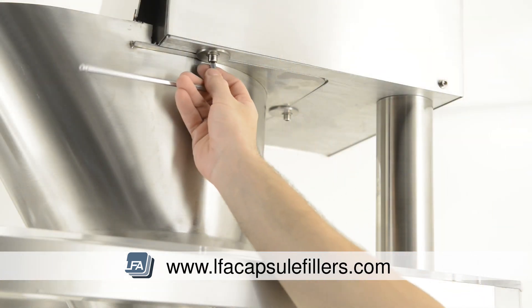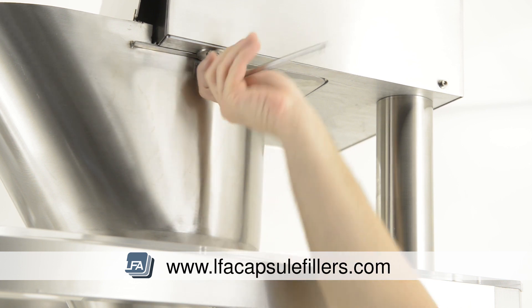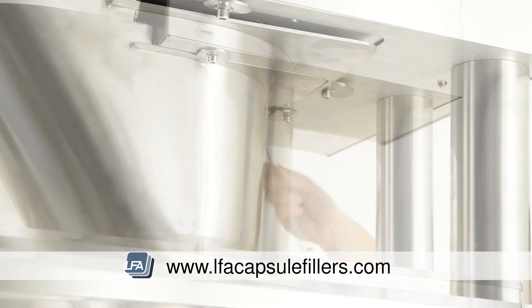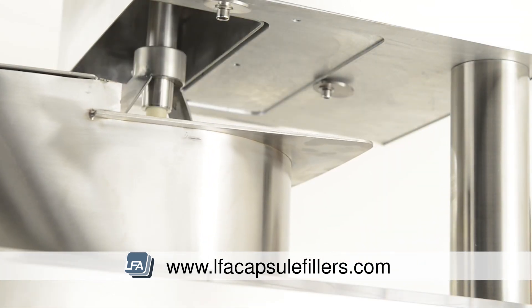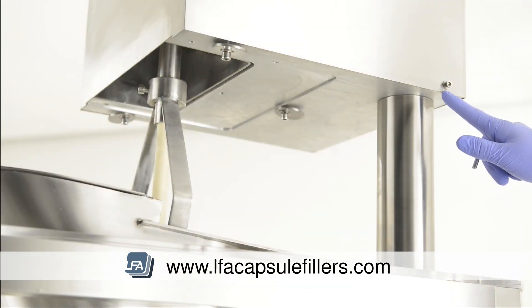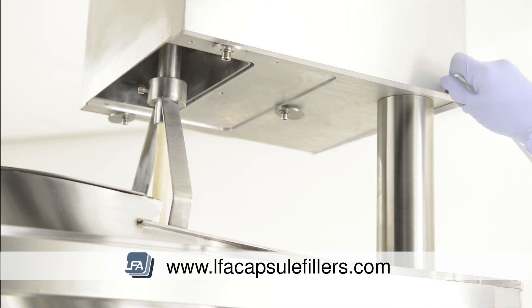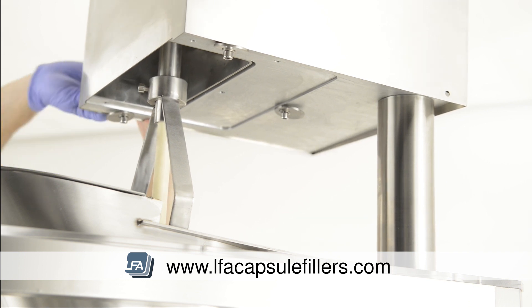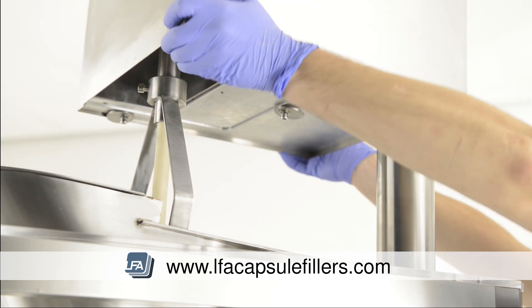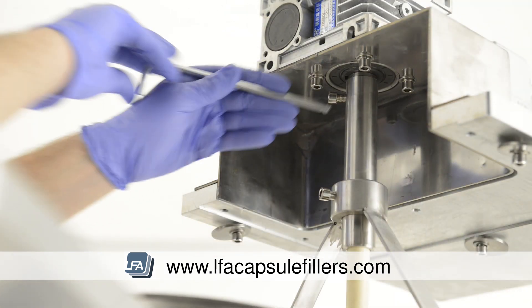Next, undo the three bolts on the underside of the top section which will allow you to remove the hopper. We suggest two people to do this, ensuring the hopper does not fall. To access the bolt to remove this, we need to remove the sides around the top section. Remove the two bolts at either side and then the top section should pull away.